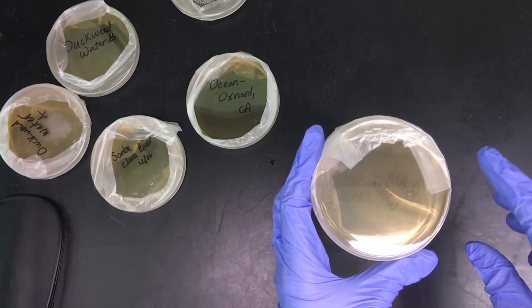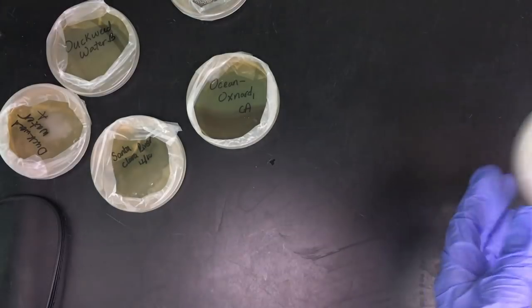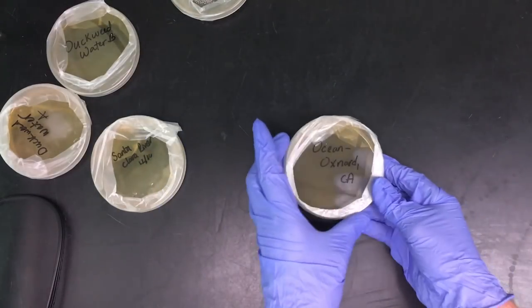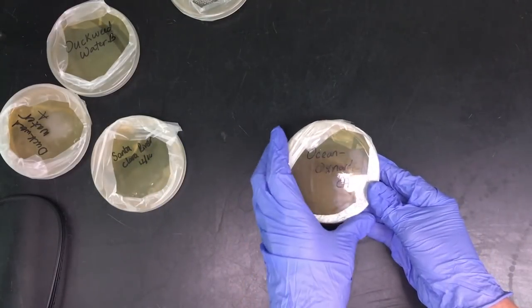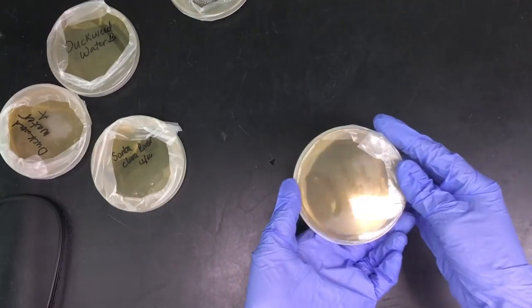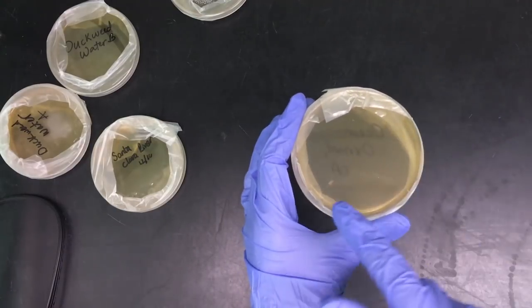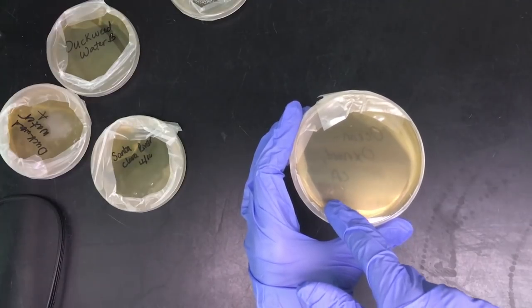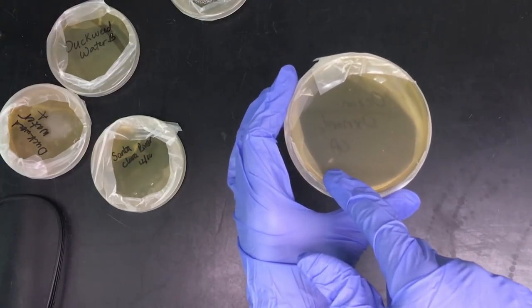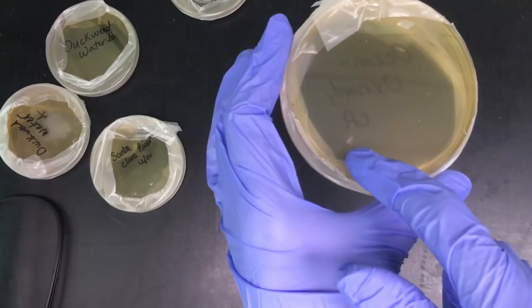This was the ocean water in Oxnard and it looks like we have a colony here. So it looks like we have one colony of coliform bacteria and it's a light pink color.